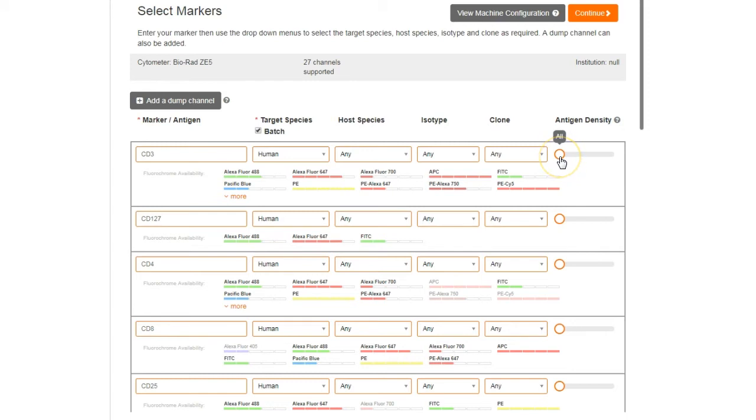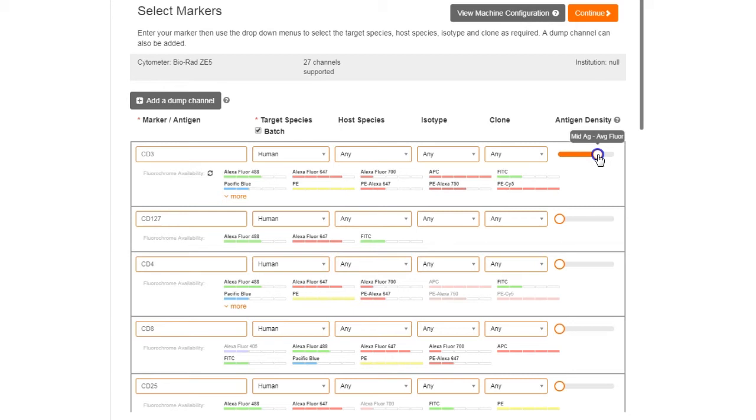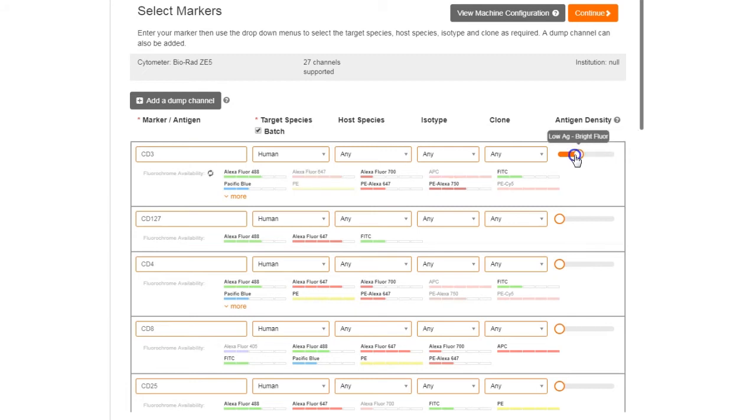You can optimize your panel for antigen density by using the antigen density slide bar. This helps you use your brightest fluorophores, such as Phycoerythrin, for poorly expressed markers and keep your weaker fluorophores, such as Pacific Blue, for abundant markers. To include all fluorophores, just slide the bar to the left.